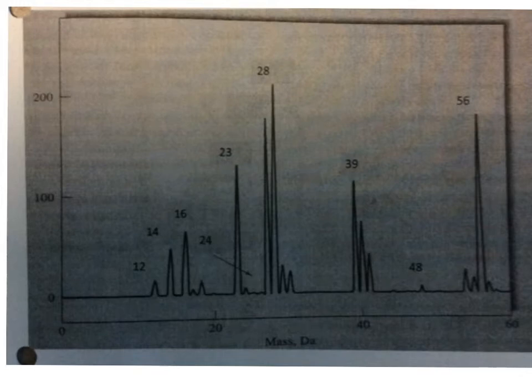So for this problem, we're looking at an ICP-MS spectrum. Since we're using an ICP, we expect to see atoms and their isotopes. We can directly identify these peaks by using a table that shows the masses of the atoms and the masses of their isotopes.